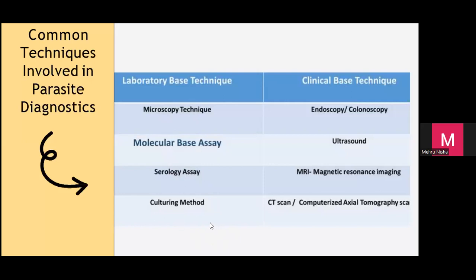Culturing pula. Apakah dia culturing? Culturing method is proses untuk membiakkan parasite tu di makmal. Kita ada cara tersendiri. Okay, di makmal saya, we actually have cultured Ascaris lumbricoides. Sampai kita ambil dari tanah dia, culture, guna sikit bahan kimia lah, dan kita dapat tengok until dia molten the 4th stage.